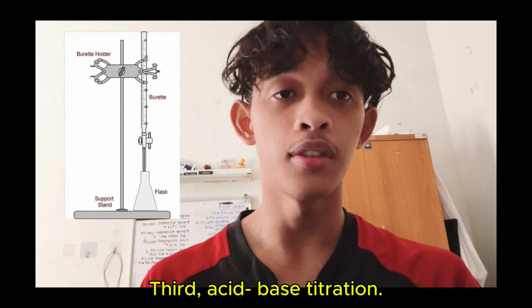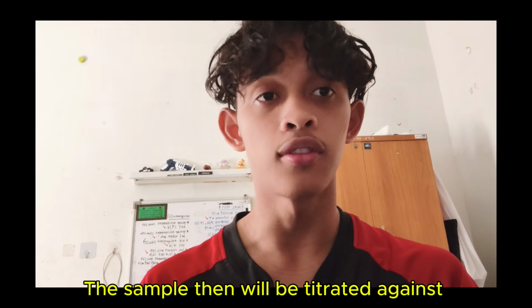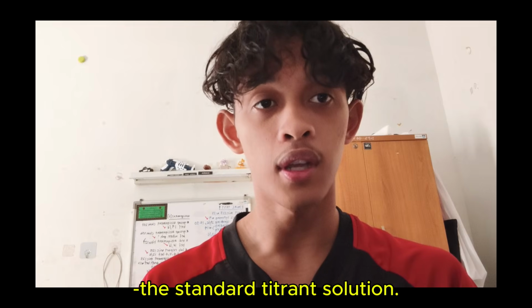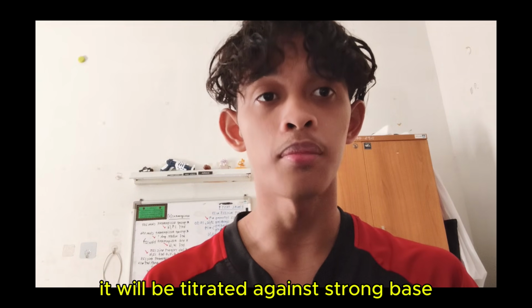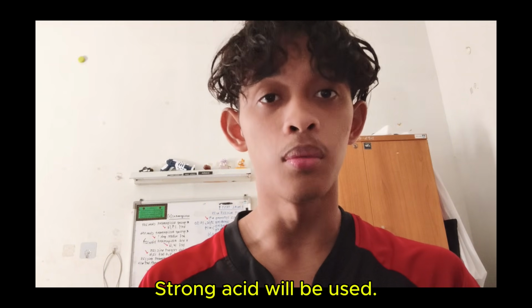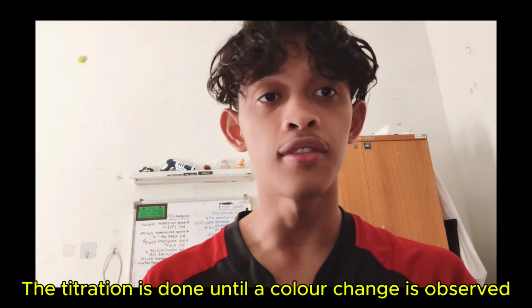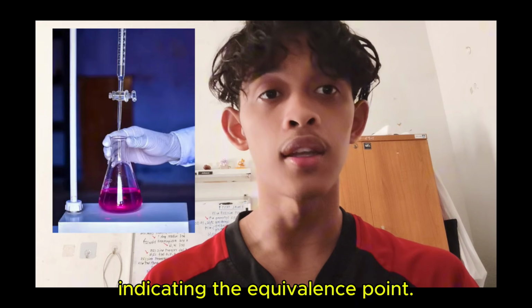Third, acid-base titration. The sample then will be titrated against the standard titrant solution. If the sample is acidic, it will be titrated against a strong base. If the sample is alkaline, a strong acid will be used. The titration is done until a color change is observed, indicating the equivalence point.